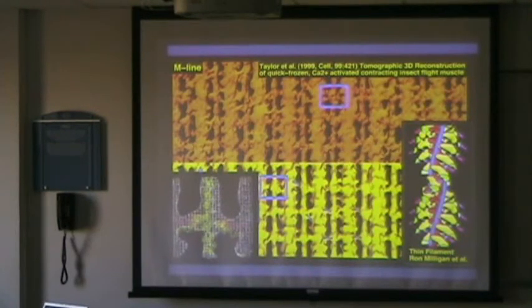And while this here is a typical helical average structure, this is the real life in an actual muscle. So here we have a helical reconstruction of an actin filament in red, tropomyosin in blue, and the myosin heads in yellow, and the essential and regulatory light chains here. Now, you don't see it that clearly here, obviously, but you see the real case. And the real case, obviously, is not as regular as this is. So that's always a bit of a trade-off in what you want to see.